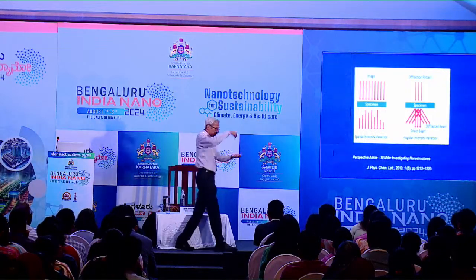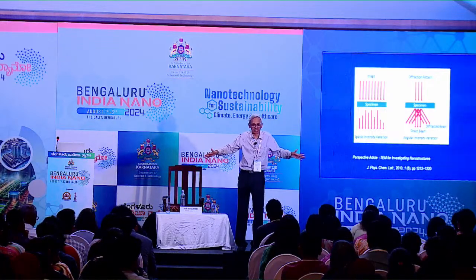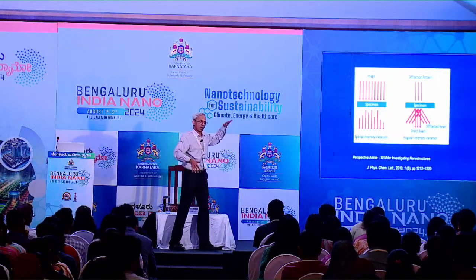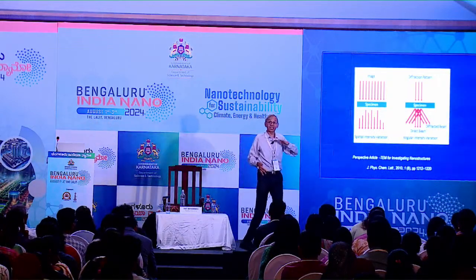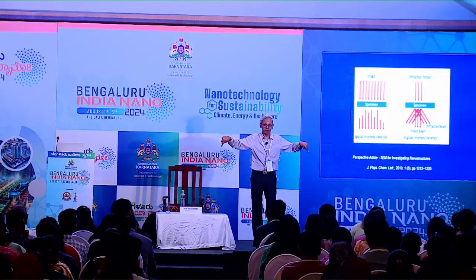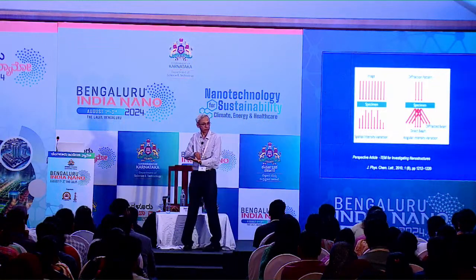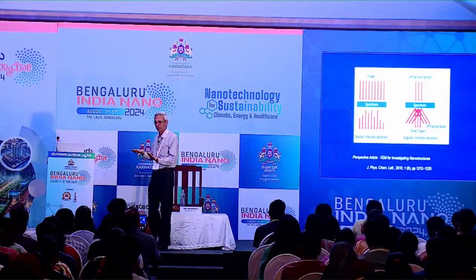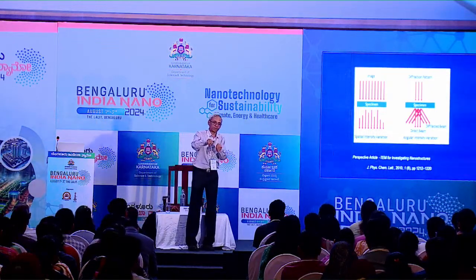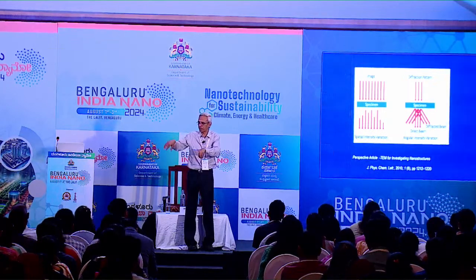Okay. So whatever is going in one direction, after it passes through the specimen, will go in some specific direction. This is called Bragg diffraction. This is your angular intensity variation when a parallel beam falls on the specimen. This is what we call a diffraction pattern. We can use lenses to focus each of these different beams to form spots. That is what we see as a diffraction pattern on the screen. So this is what you see as electron diffraction patterns, right? You see multiple spots, which means the beams are going in different directions, and a lens is used to focus them onto different points.